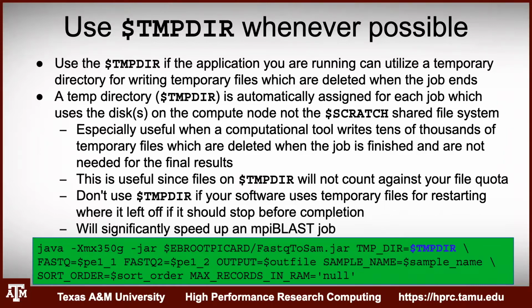To get around that, we can use TMPDIR, which creates a temporary directory for writing all those temporary files. It is automatically assigned to each job, and it uses the disk space on the compute node and not in your scratch folder. So it's not going to count against your file quota.